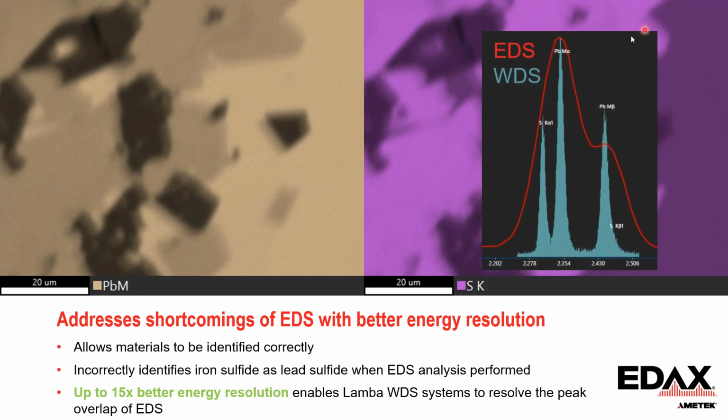If we look at the spectrum, this red outline is the EDS spectrum. We see sulfur and lead are heavily overlapped. They cannot be resolved by EDS. But in this cyan color WDS spectrum, we see sulfur K and lead M are separated out.